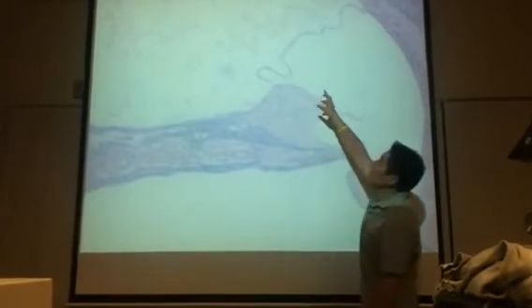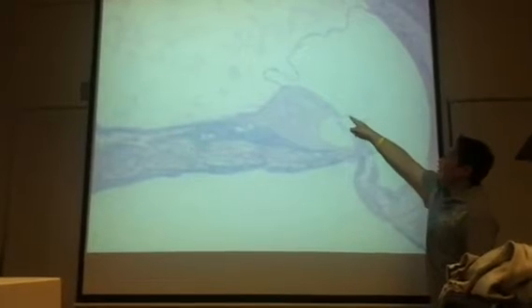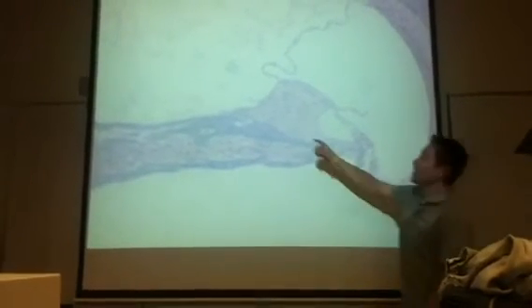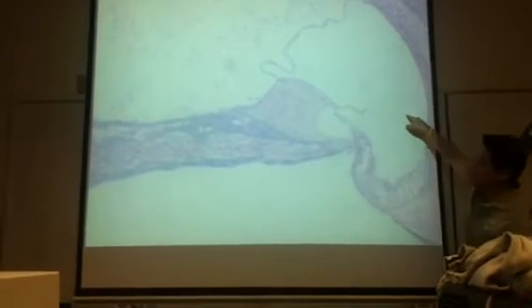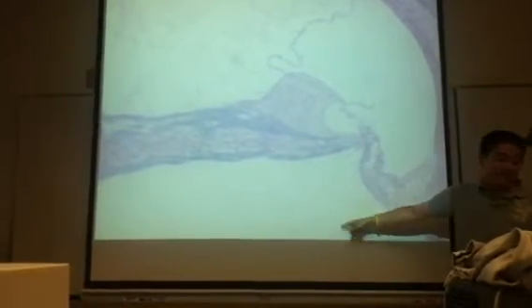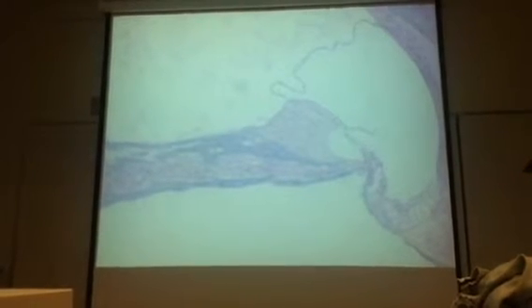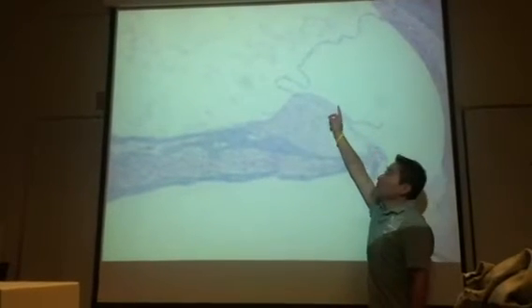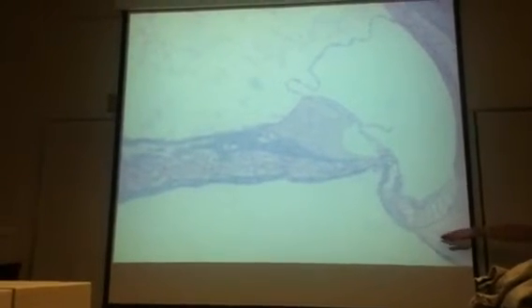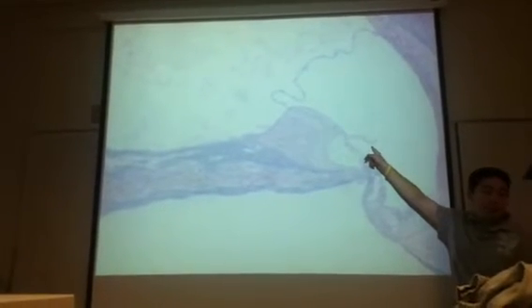This membrane — this thin one right here — is the vestibular membrane. This one down here is the basilar membrane. And this little one with the hook on the end is the tectorial membrane. The vestibular membrane borders the scala vestibuli. They sound similar, but the one at the bottom, or the base, is the basilar membrane, and the short one in the middle is the tectorial membrane.